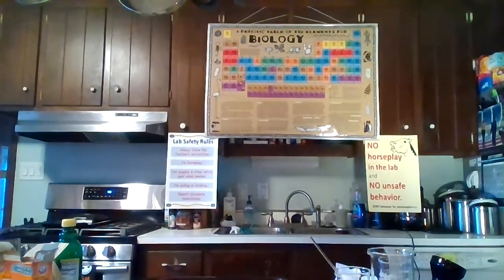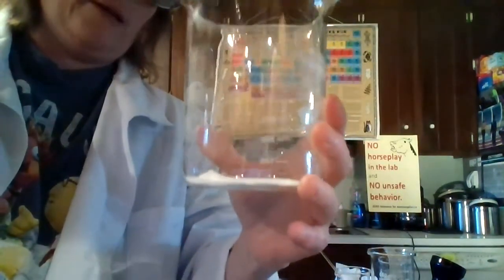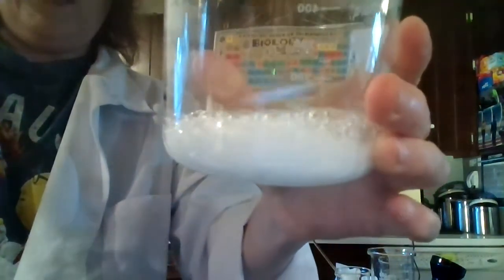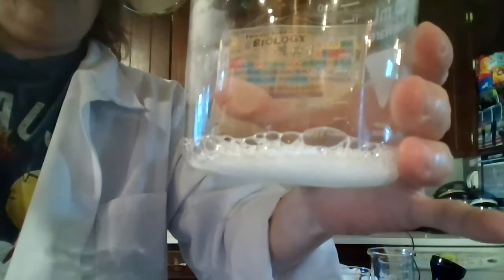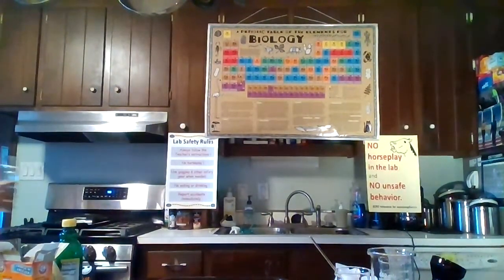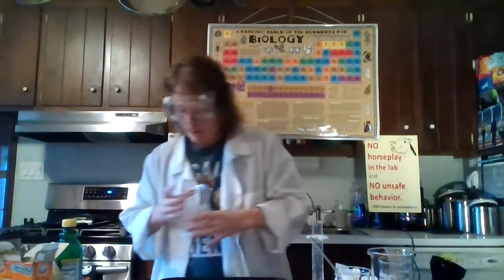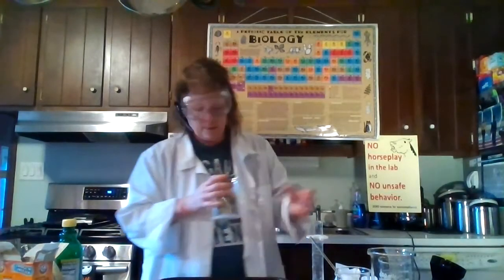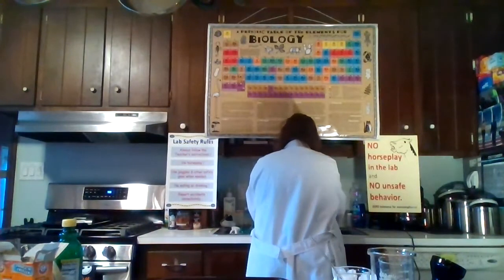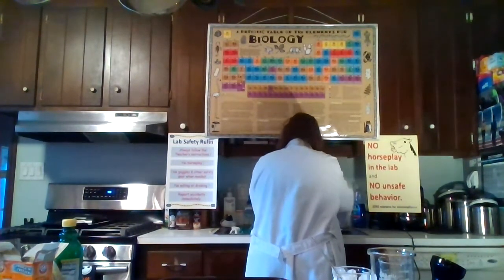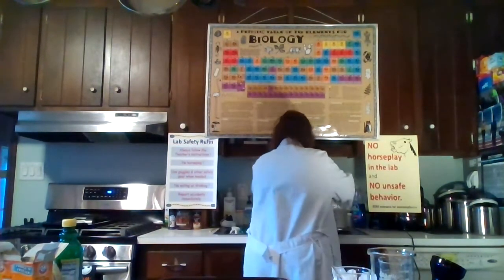Coming around — you can see our baking soda is in there. Vinegar is in the graduated cylinder. Let's add it. And one more time, we got that bubbling action. I wish you could smell it — it smells like vinegar. Not as exciting as the lemon juice, but you still got a similar reaction. So go ahead and answer your questions for that one. Empty the container and rinse the container and graduated cylinder.